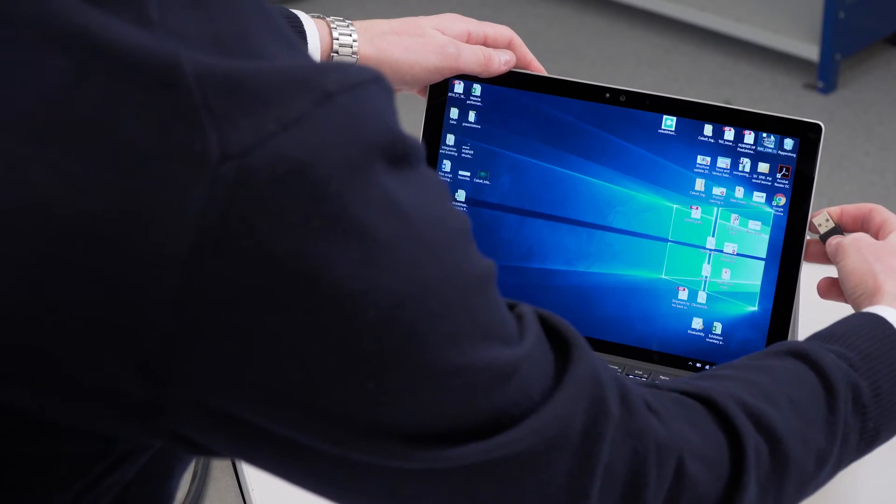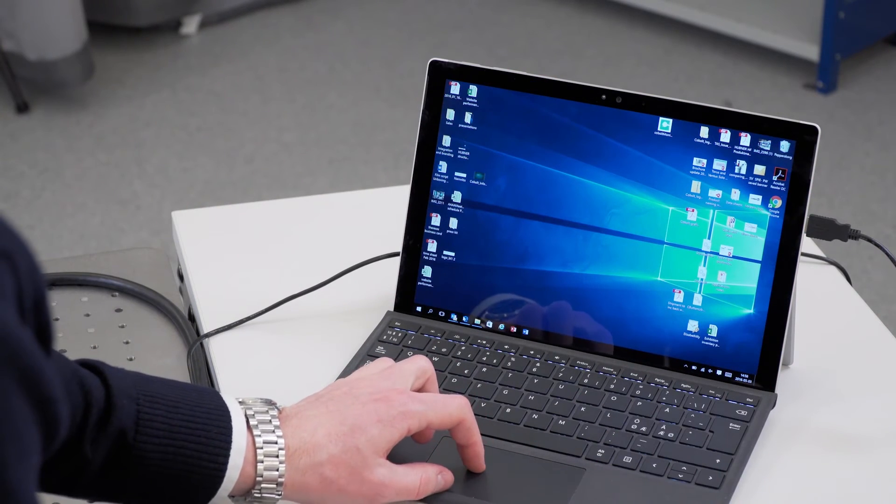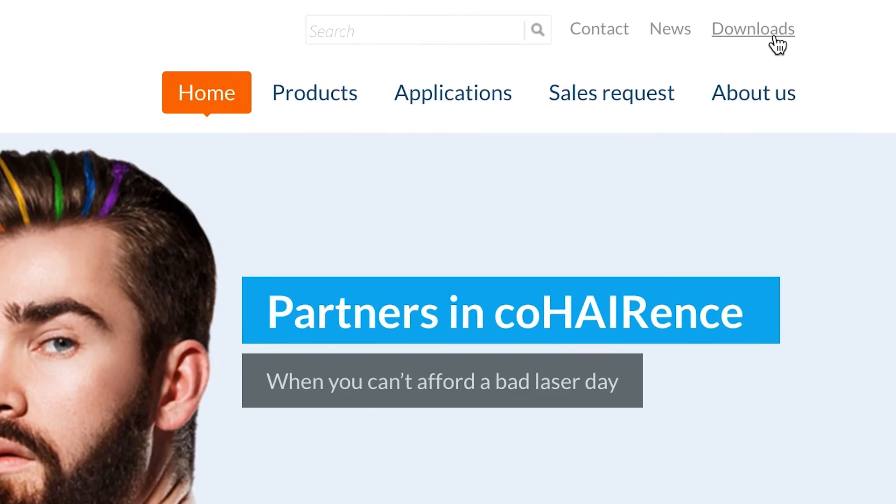Once your laser system is set up and ready to run, you can use our software to control and monitor the performance. The Cobolt Monitor software is downloaded directly from the Cobolt website.